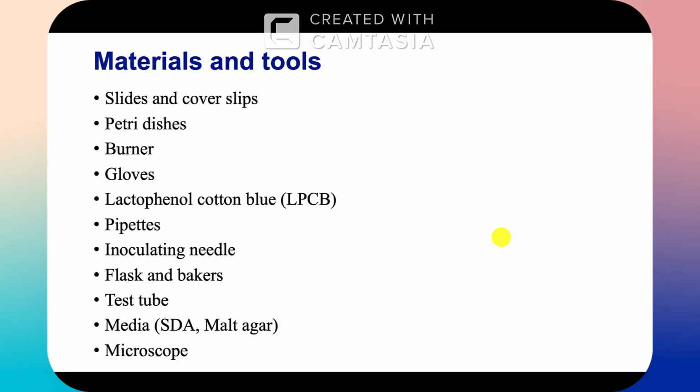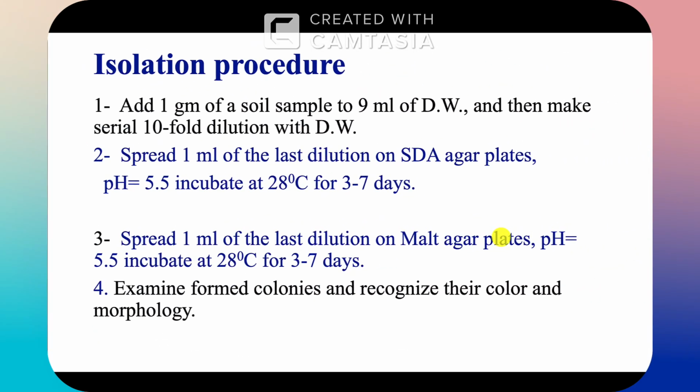Microscope, of course, and we need the staining solution, which is lactophenol cotton blue. We have all of this, and you will work by hand together in the lab.